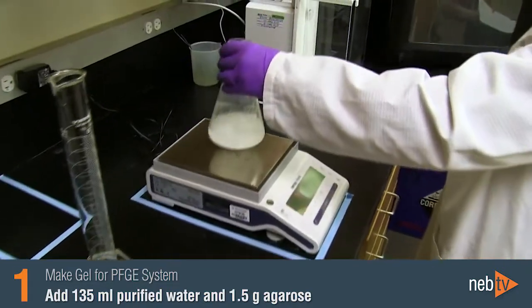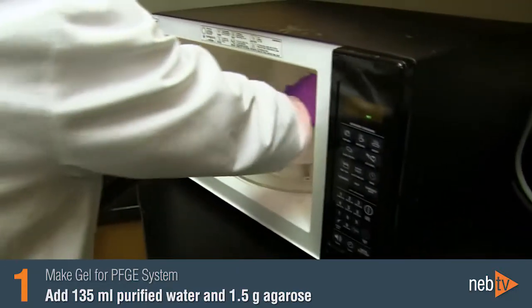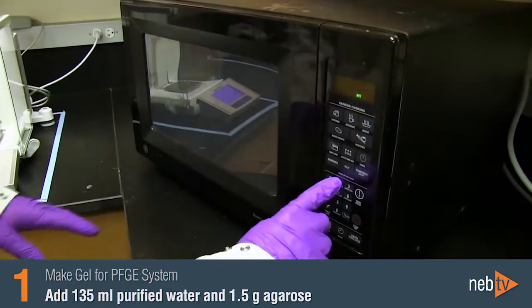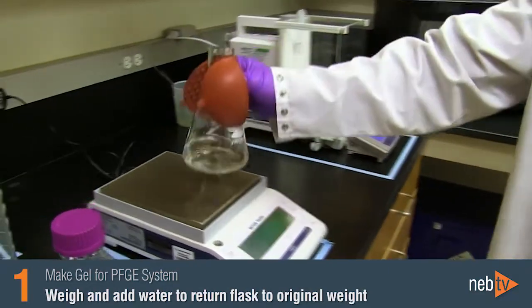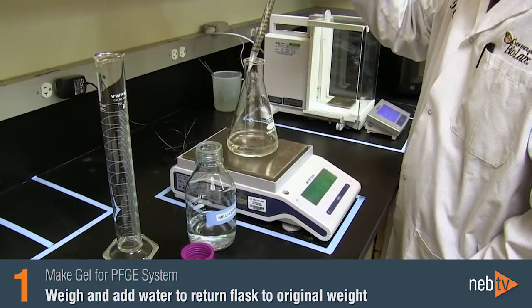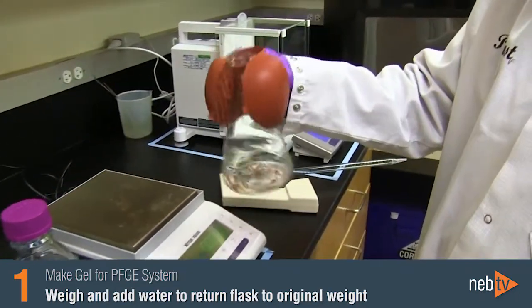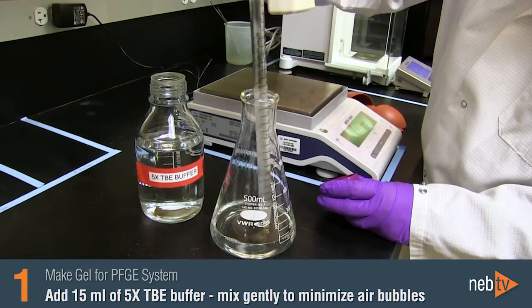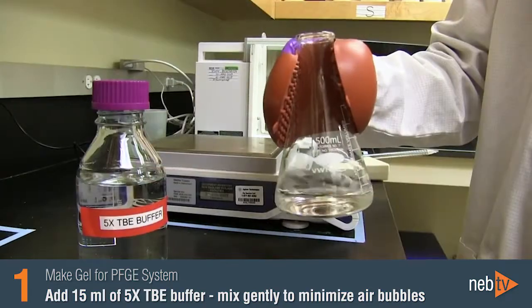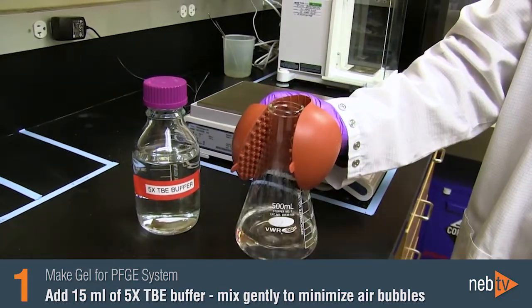Weigh the flask, then heat it in a microwave for 2 minutes. Weigh the flask again and add water to return the flask to its original weight and mix well. Add 15 ml of 5x TBE buffer. Mix gently to minimize air bubbles. The agarose solution is then ready.